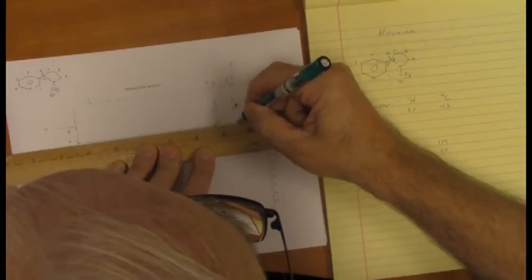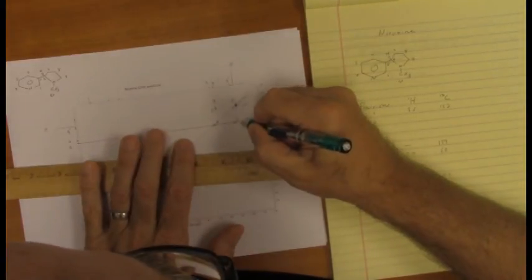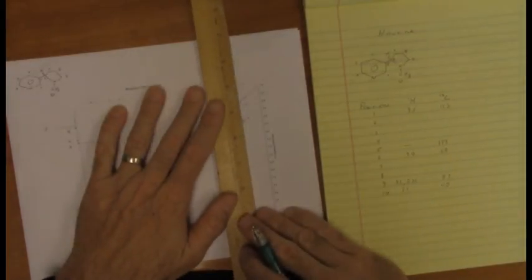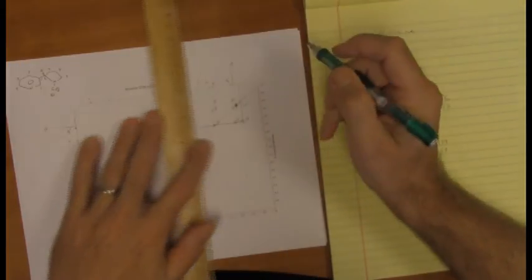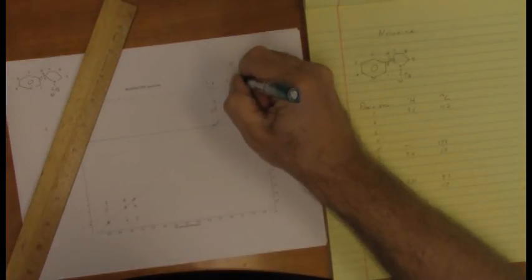But there, right there, that is a new cross peak. And that must mark one of the protons of position 8, the only other set of protons close to position 9. So I take that cross peak, turn, move on up to the other axis, and that must be one of the protons of position 8.